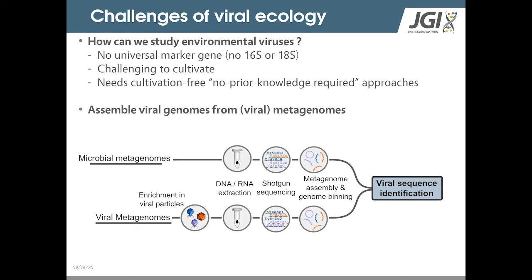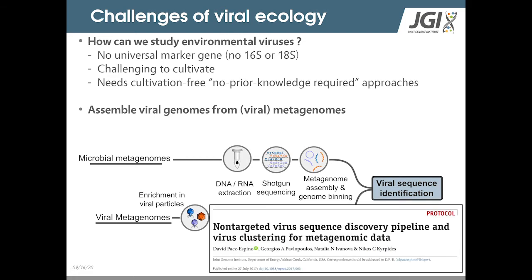But I'll go through this major step of going from pieces of genomes to here are my virus genomes. And if you want to know more about the technical details about this, David Paez-Espino has published in 2017 a protocol to perform this kind of virus sequence identification. There are also a number of other tools, but this one is really nice because it's a step-by-step explanation of how and why you do this.